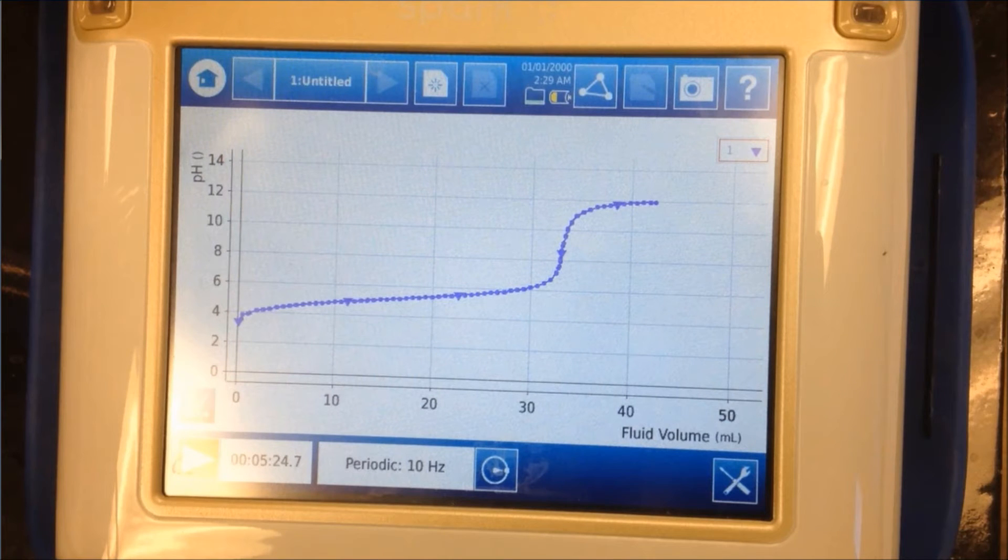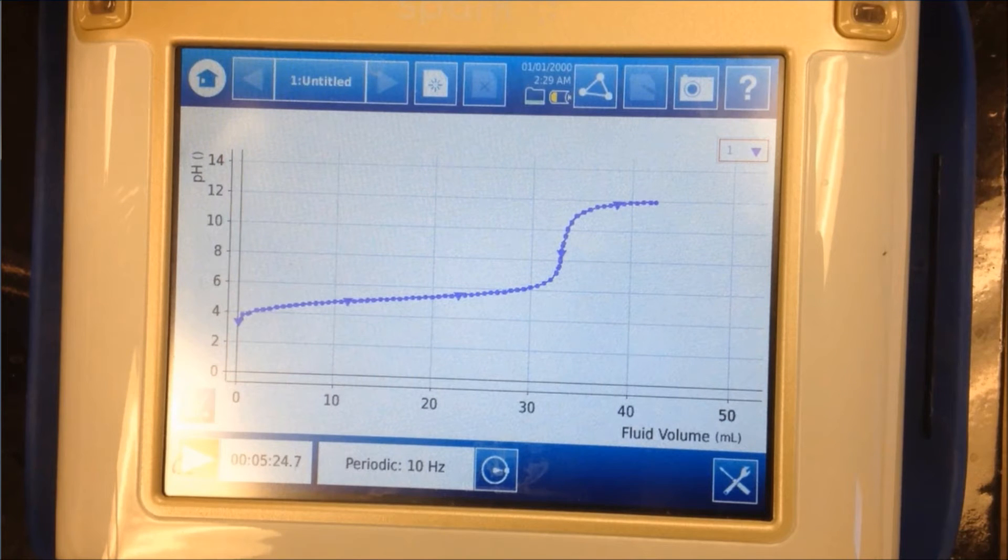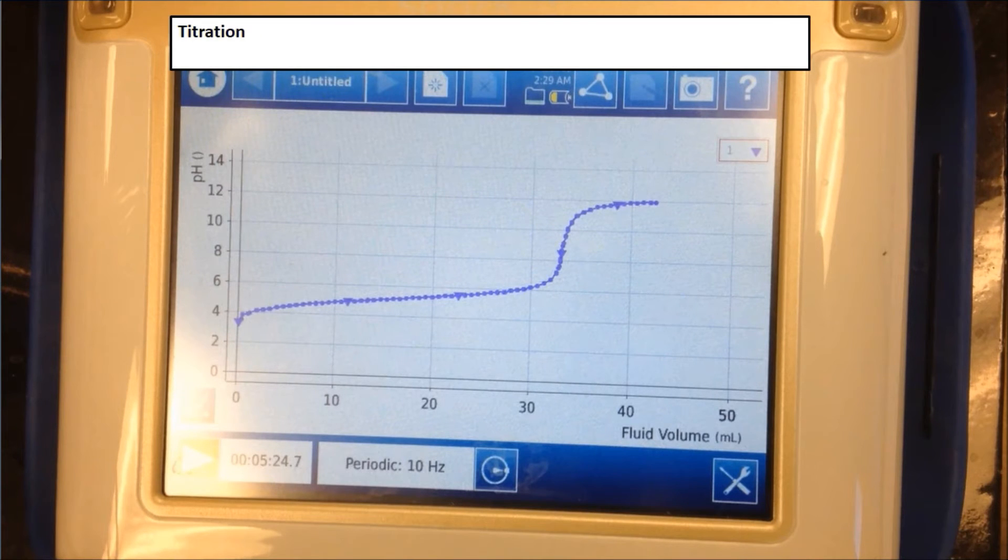Here we have the titration curve for our experiment. A titration curve is a curve that compares the pH to the amount of titrant added. The titrant would be what goes into the buret. The titrant in our case is the NaOH. On our graph here, the amount of titrant added would be on the x-axis right here, and the pH would be on the y-axis, which is right here.